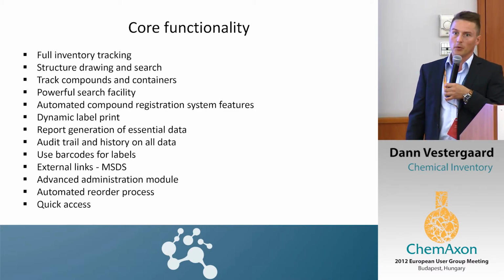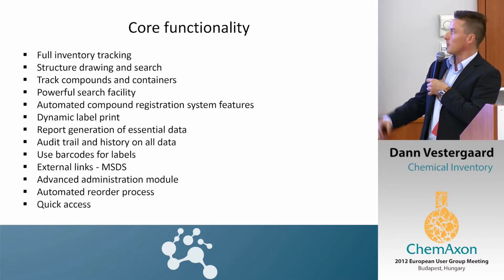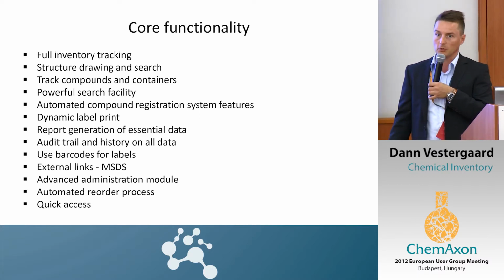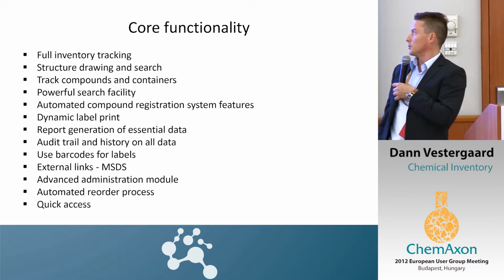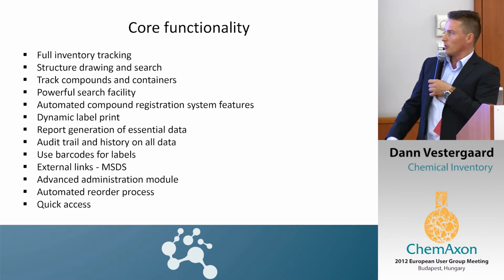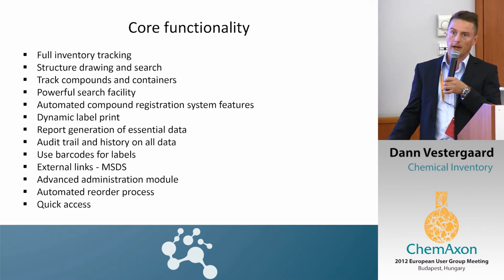You can add external links, and you can upload PDFs and any other type of documentation to your compounds and containers. You have a full administration module where you can maintain any part of the data in the system. You have an automated reorder process, and furthermore, besides that, the mobile version is almost ready, and we have also a quick access that will speed up the day-to-day operation in the lab when you need to take out and check in containers.